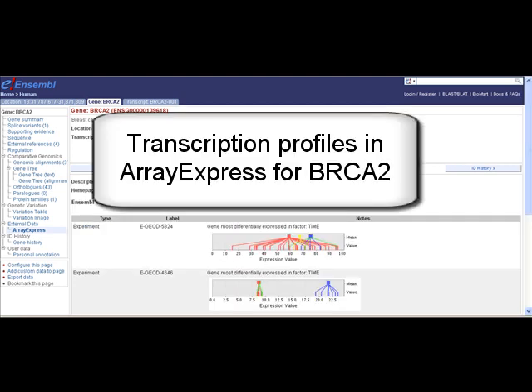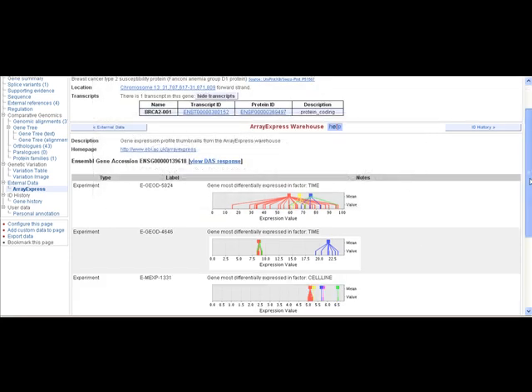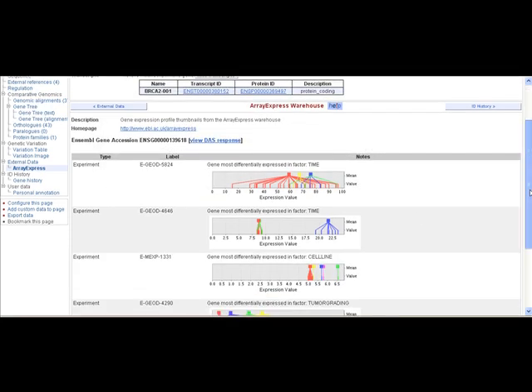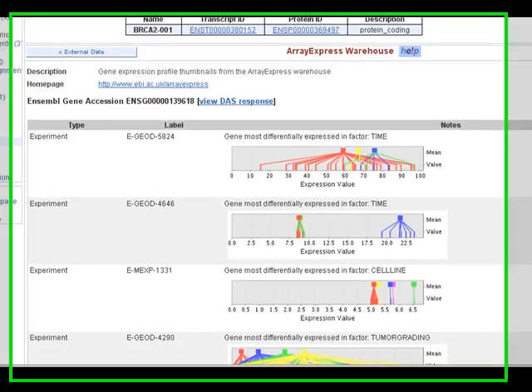There is information in the ArrayExpress Warehouse for BRCA2. It's listed below. Several experiments have been run, looking at expression profiles.